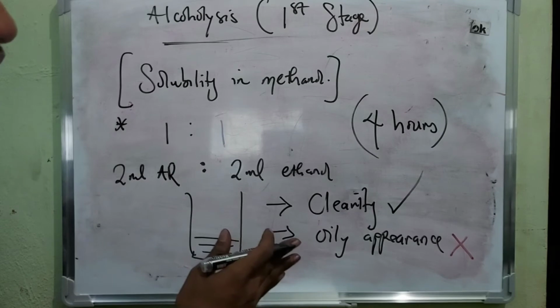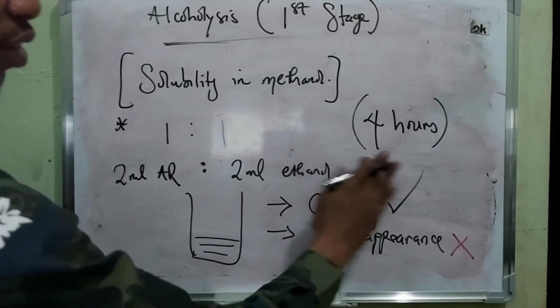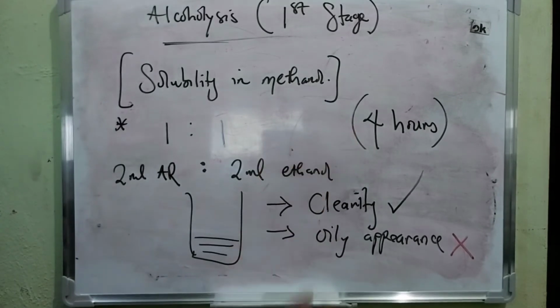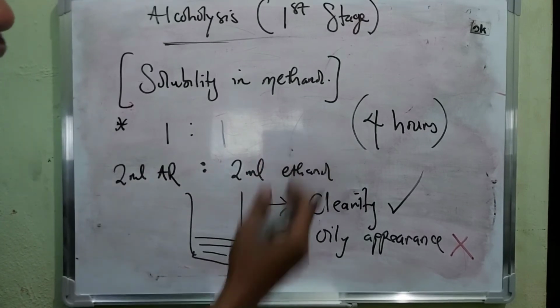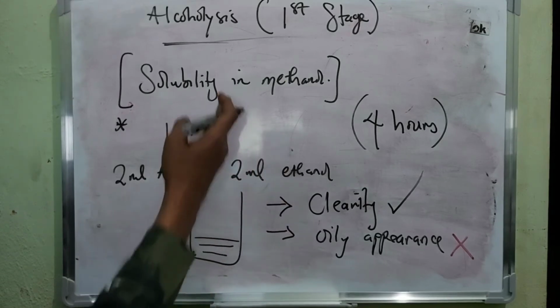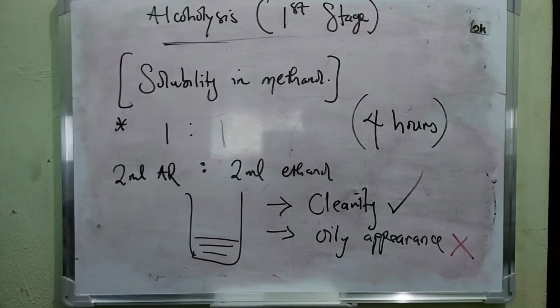Once that is ascertained, the minimum is 3 hours; you can't get the monoglyceride formed under 2 hours. It's impossible. So a maximum of 4 hours, 3 to 4 hours should give you the solubility that you so deserve.